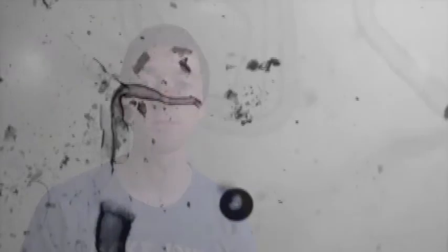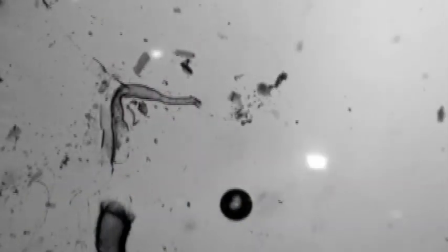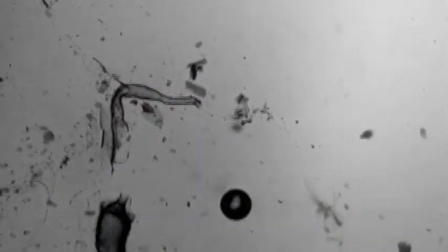This works because of convection currents. It's exactly the same thing that happens when hot air rises beside a radiator. Here the laser heats up the dye molecules in the solution. The hot dye solution rises causing a flow towards the laser spot. This pulls the end of the growing tube towards the laser.